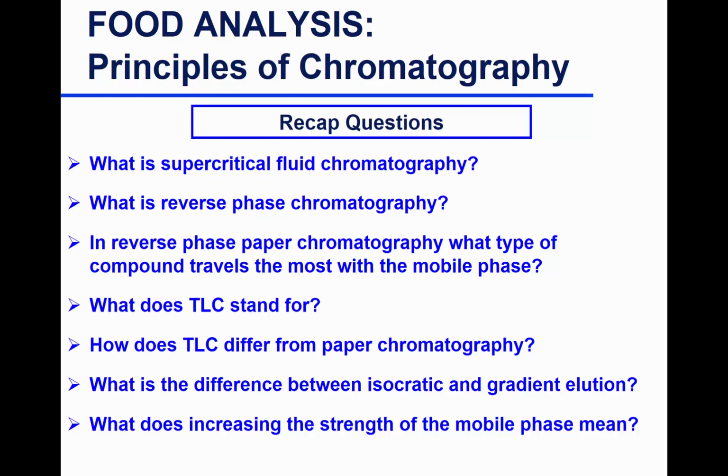And the opposite is true. If you're starting with a polar stationary phase and then you want to increase the strength of the nonpolar mobile phase, you add water. So you decrease the percentage of organic and increase the percentage of water. So depending on what your stationary phase is, the way you change the mobile phase is different. It's not always in one direction.